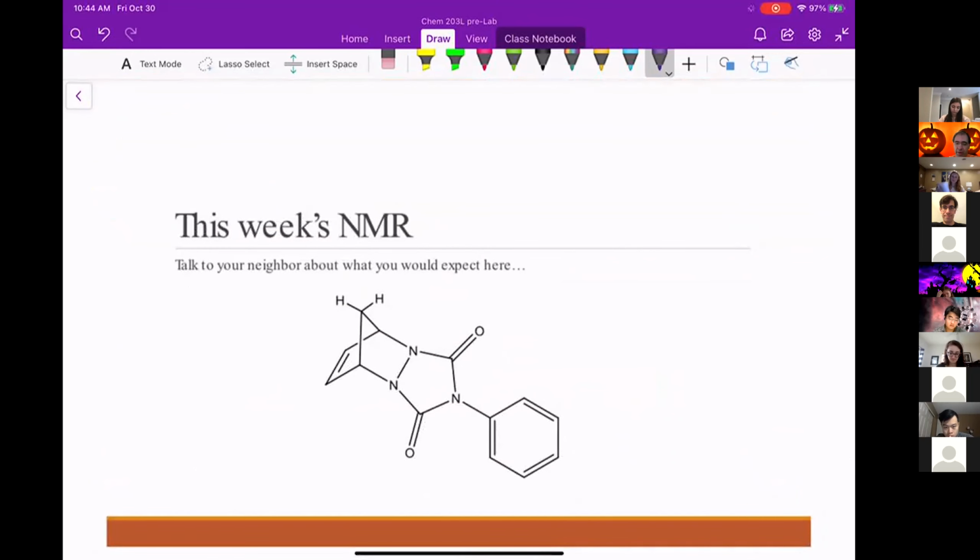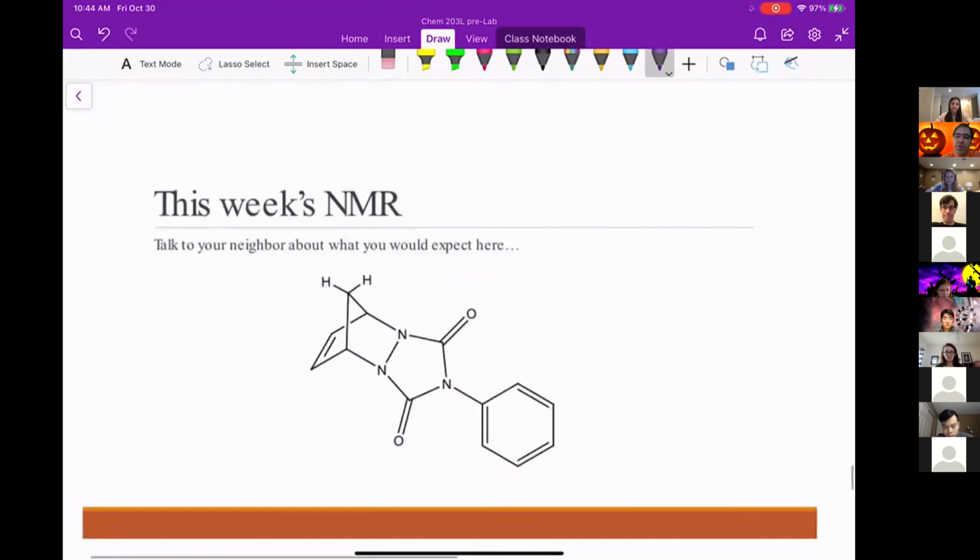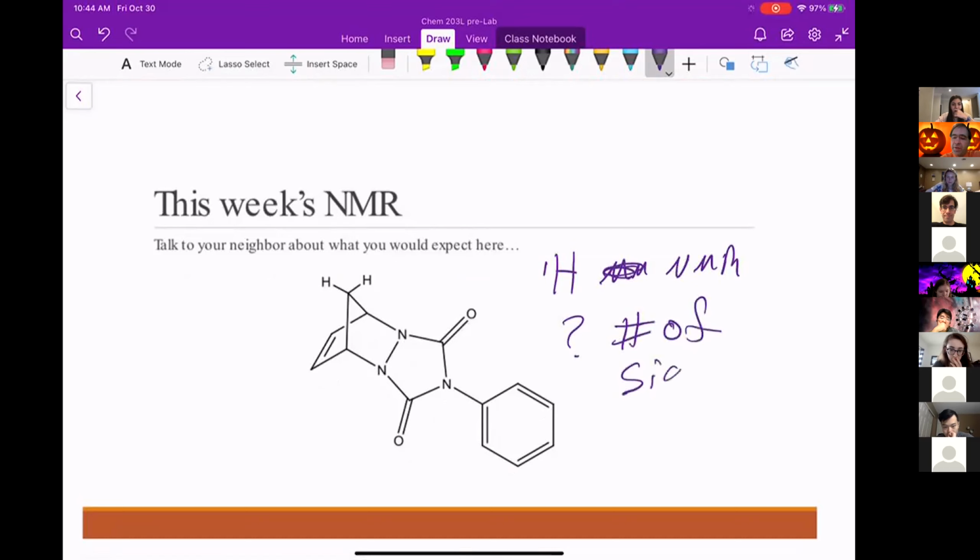I want to try to help you a little bit. So we're going to make this product. Normally I would have you talk to your neighbor, but a few of you have people walking through in the background, and they probably aren't going to know what you're talking about. So in the chat, how many different types of NMR signals would you expect in the proton NMR? And I will tell you that because of using different instruments, you might get different answers, so you're not going to be wrong. You don't have to worry about that.